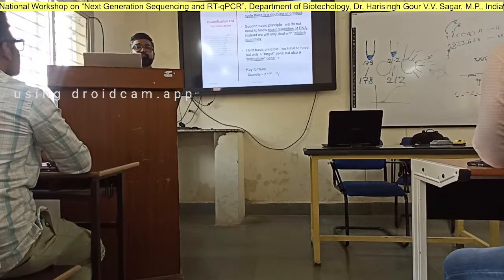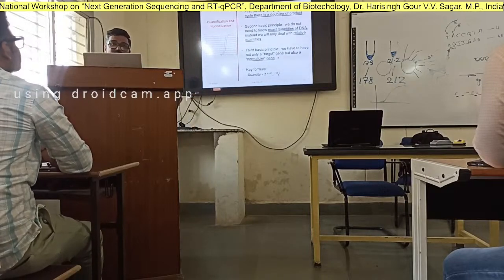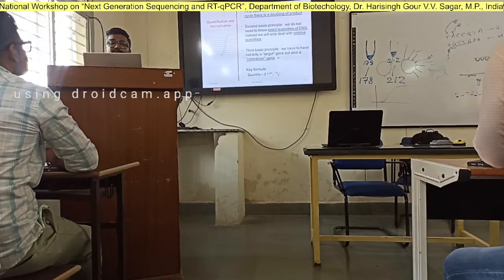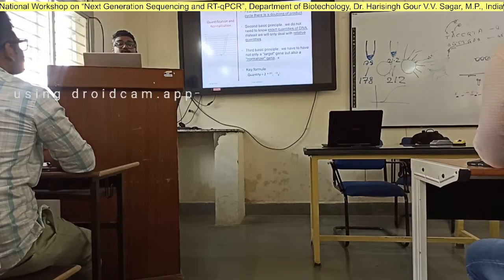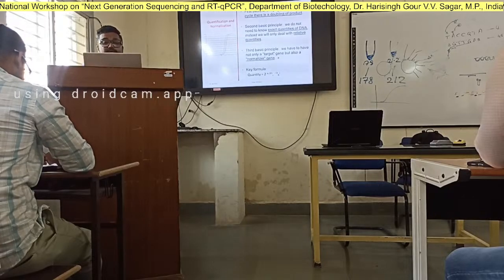So first, we assume that every cycle there is a doubling of product. Next, we do not need to know the exact DNA, but since it is relative quantification, we just need to know the relative quantities, right? But that brings us to the third basic principle.